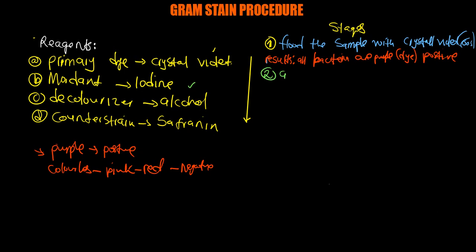So add iodine. You just add the iodine for how many seconds? You do the same 60 seconds for stage one and stage two. So this iodine, it uses what? It uses mordant. So that's what we call the mordant stage.